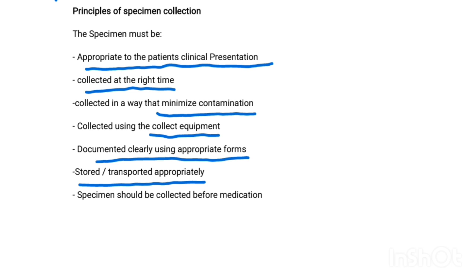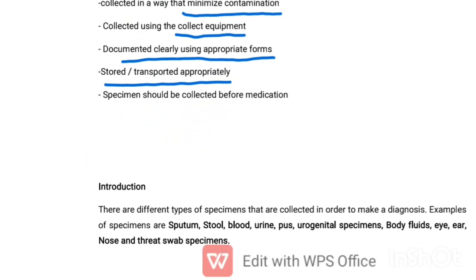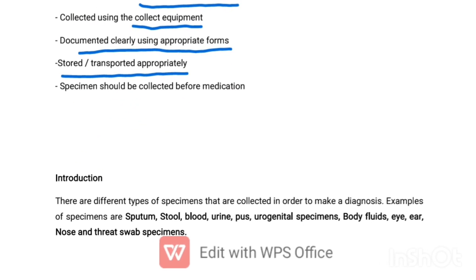Then the specimen should be collected before medication. If a patient has taken medicine and then the sample is to be collected, what can happen?